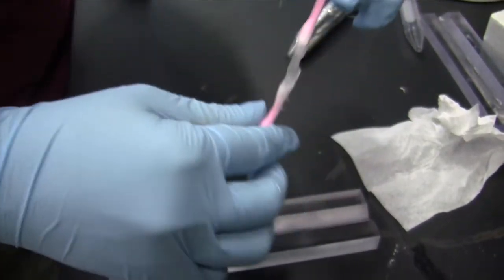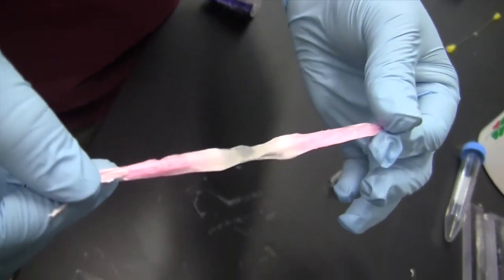We subsequently roll these meshes and encapsulate them within a hydrogel phase to result in 3D electrospun constructs that possess the approximate dimensions and the correct shape for engineering human bone-ligament-bone tissues.